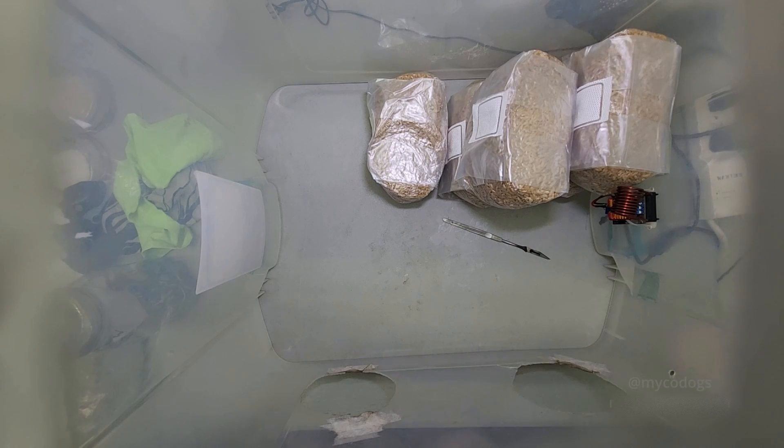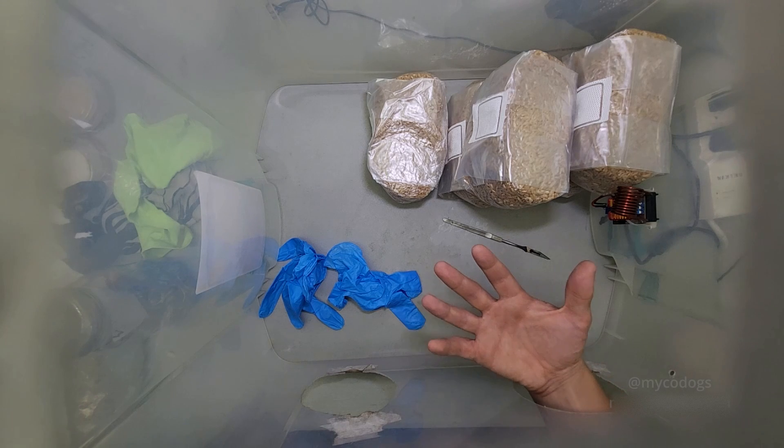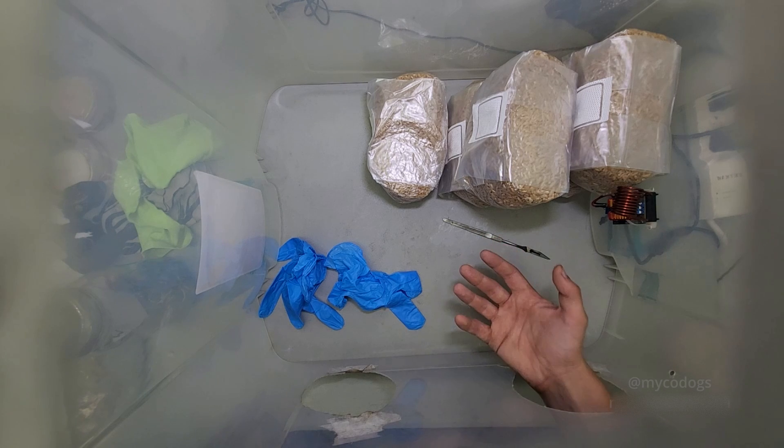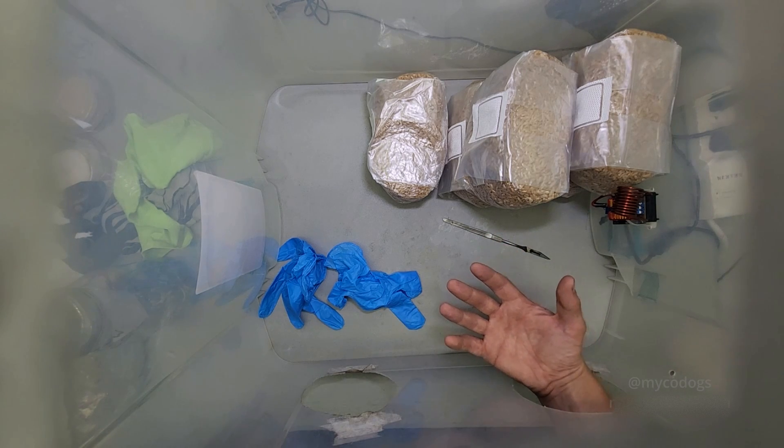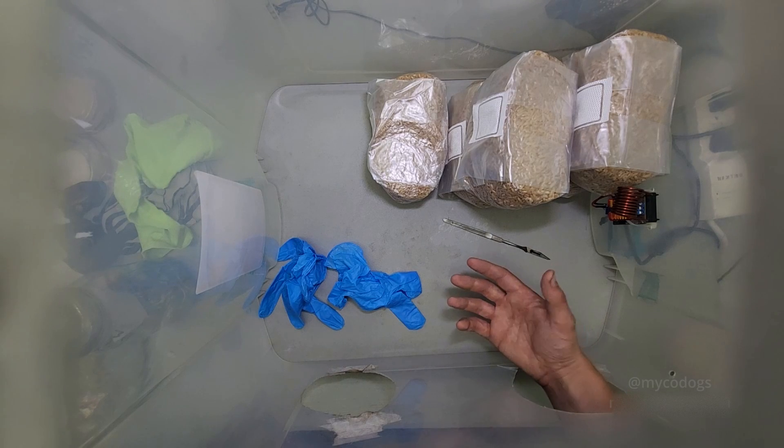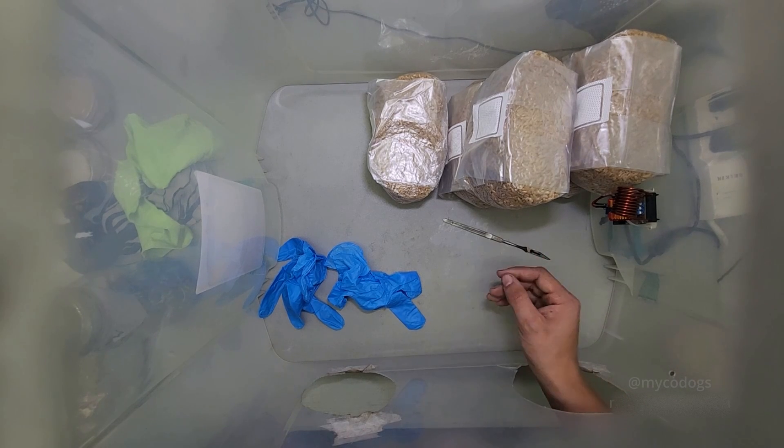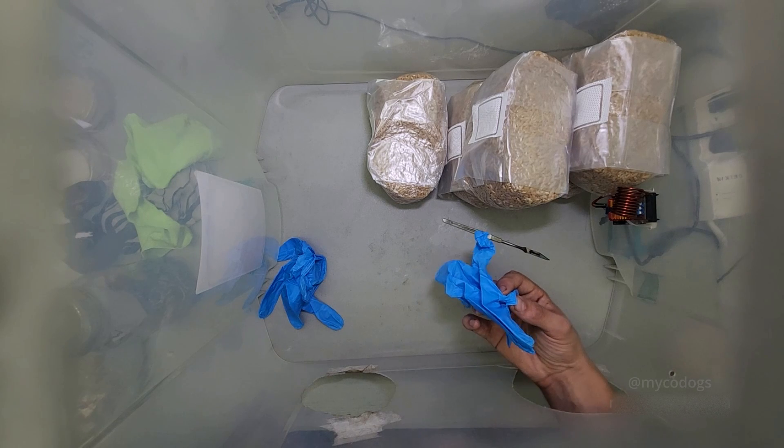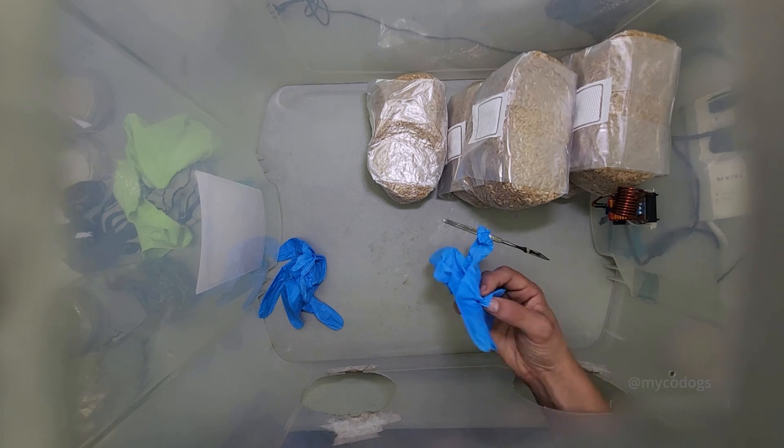Some of the tools that will help you out when you're working in your still air box is a pair of gloves. There's a lot of bacteria and other microorganisms that live on our skin as well as dead skin cells falling off, which we need to keep off of our workspace. While this can be done using sterile technique and just not allowing your hands above anything sterile, the gloves are a good added measure of security, and I would recommend it to most people.